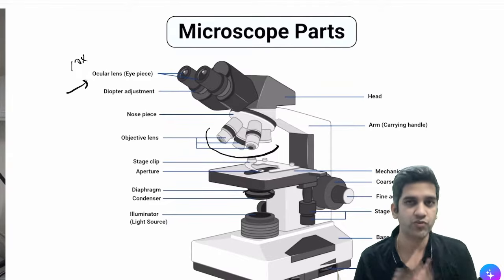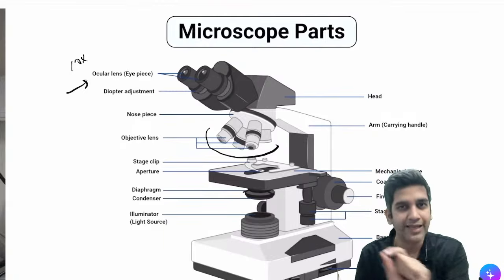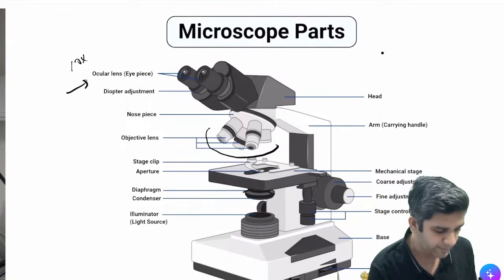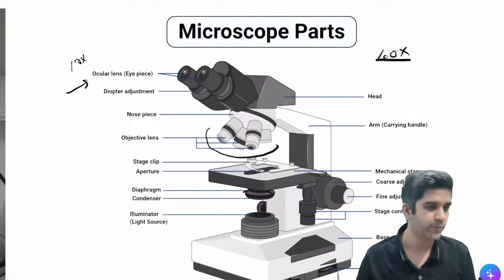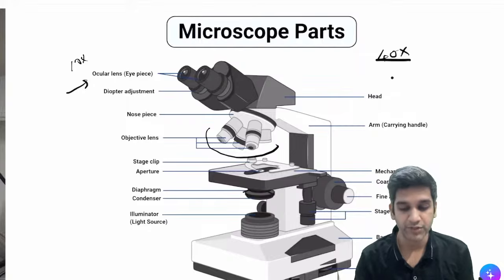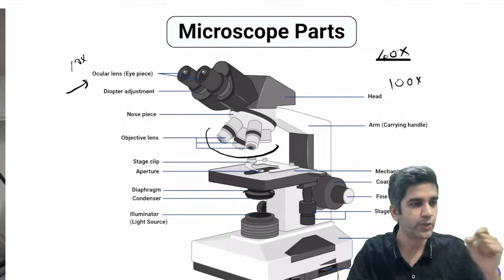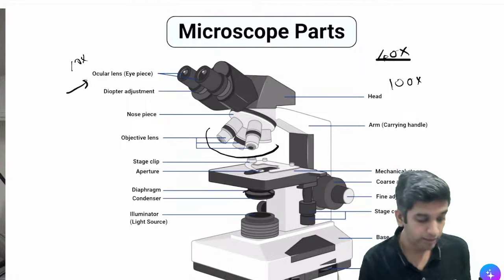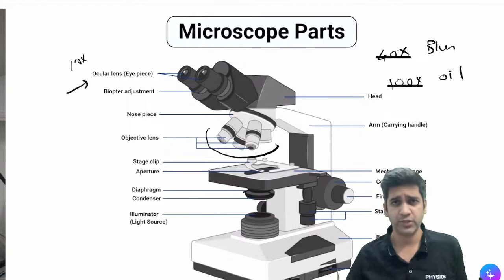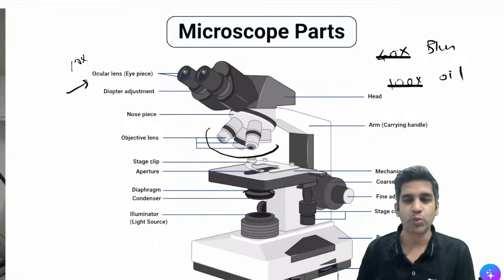There are 4 colors of objective lenses. Everything has a power, and also has a colored line on every lens, like what you saw in the last class. Can anyone tell me the color for the 40x objective? And the color of the 100x objective? Everything has a slightly different color. A blue line will be 40x generally, and oil immersion, the 100x, will have a white line, right? Okay, great. Fine. So these are a few things we saw.